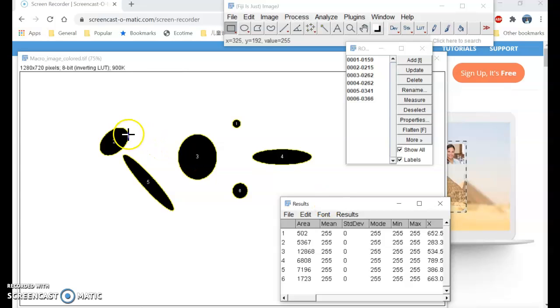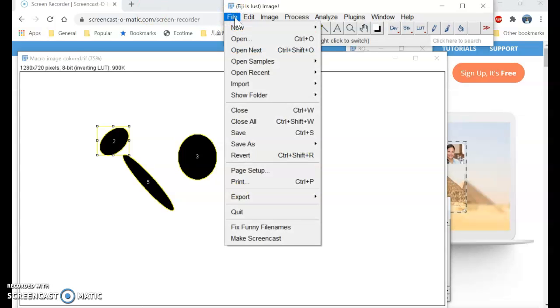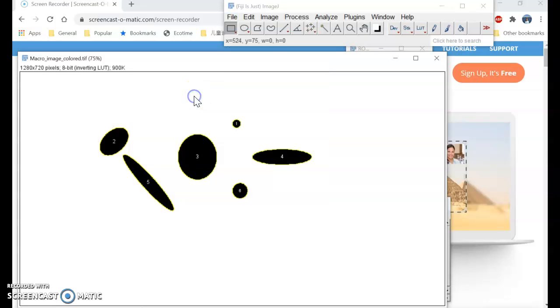And to get each of them, I need to crop, then save the cropped image into a particular file. It can be very time consuming if we have many spots and many images. So the following is that I'm automating it.